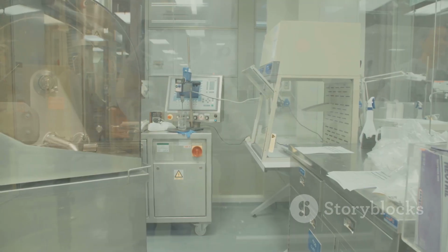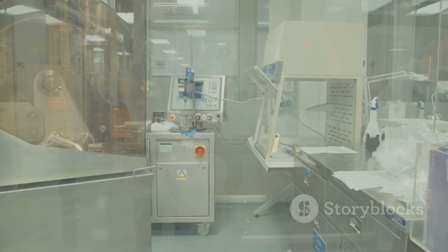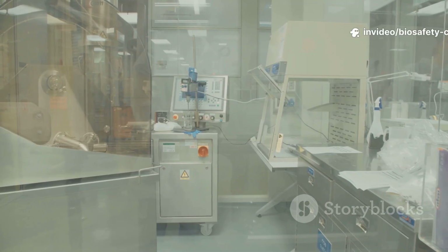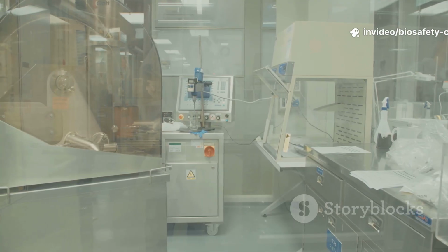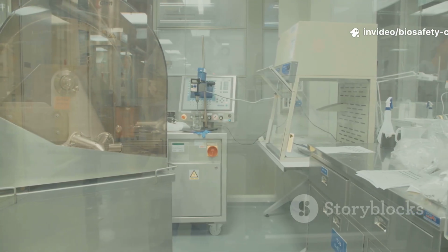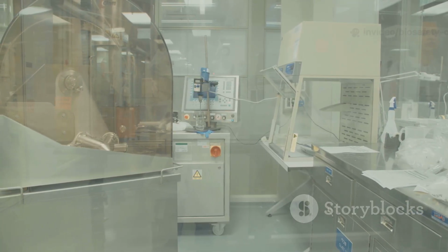Class 2 B1 cabinets have 100 feet per minute inflow, but about 70% of air is exhausted after passing over the work surface, while 30% is recirculated. They're used for work with small amounts of toxic chemicals and radionuclides.